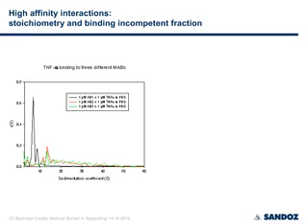Okay. In the biopharmaceutical field, we usually deal with high affinity interactions. So interactions far too tight to be analyzed in terms of KD by the absorbance or interference optics. But what you can do is, because you are far above the KD, and also if you have a high affinity interaction, it usually has a very slow k-off rate, usually in the range of 10 to the minus 5 or even slower.